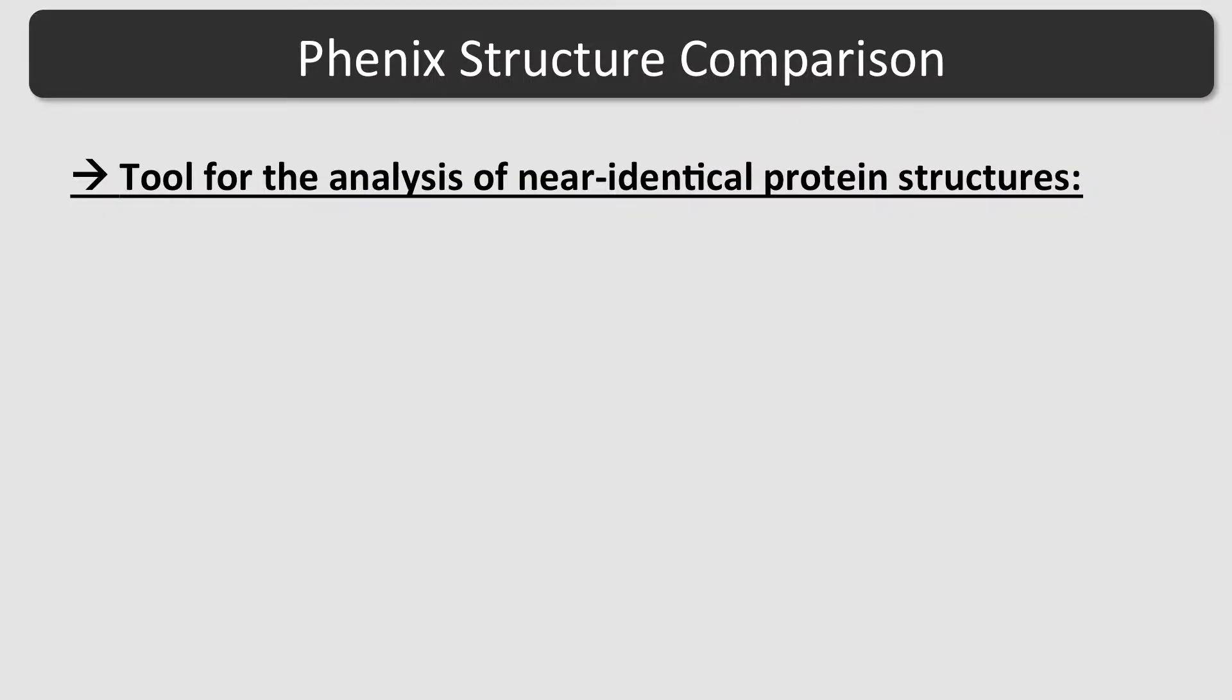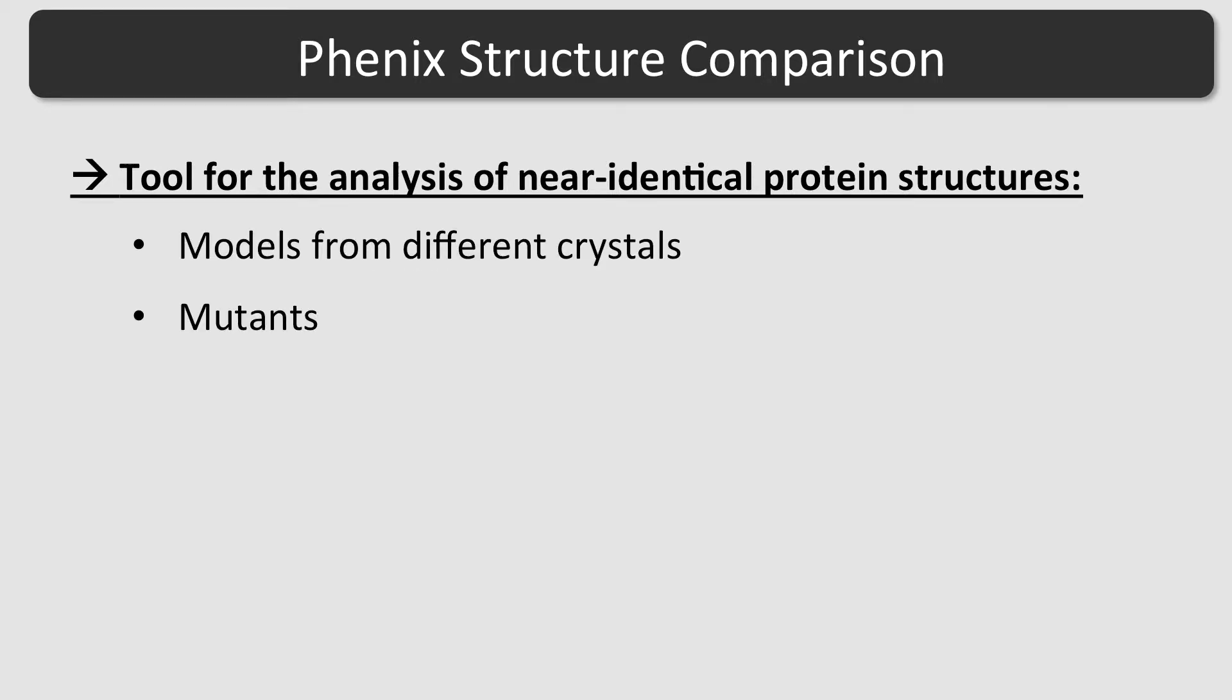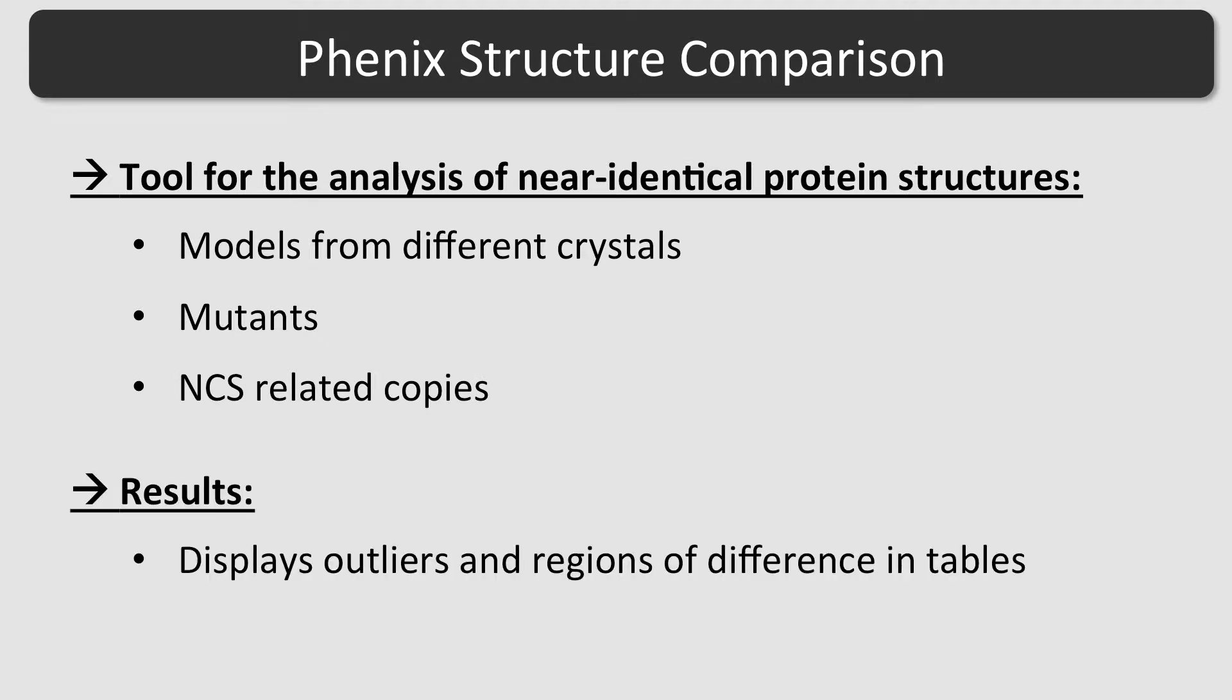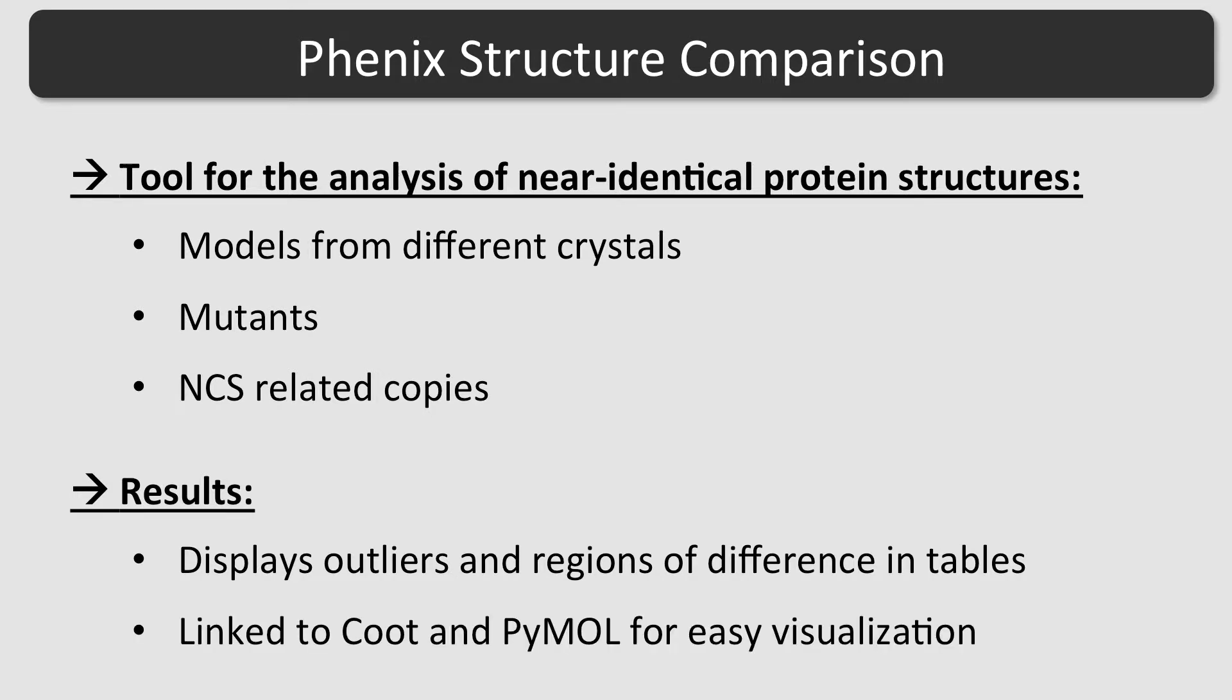Structure Comparison is a tool for the analysis of near-identical protein structures, such as models from different crystal forms, various mutants, or NCS-related copies. It displays validation outliers and regions of difference in tables. The GUI is linked to COOT and PyMOL for easy visualization.